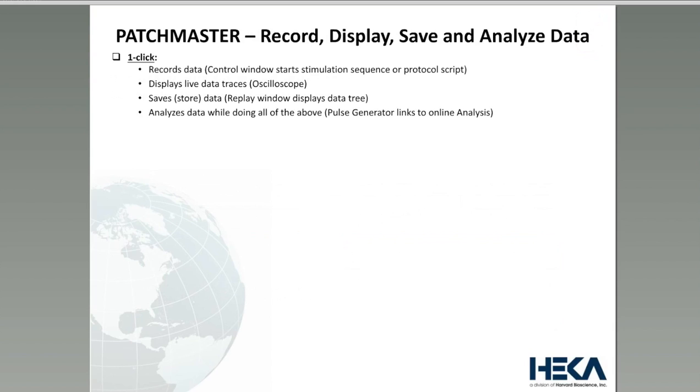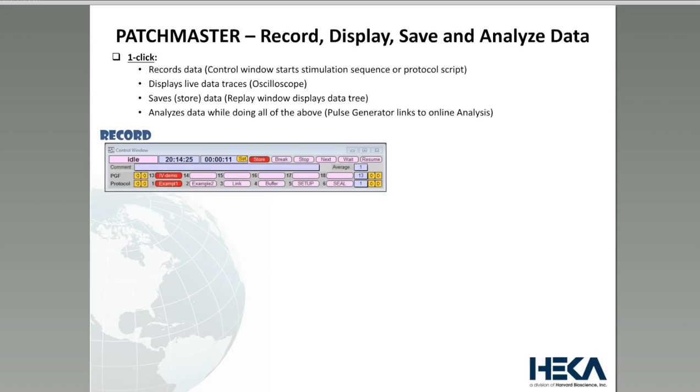Now, this brings me to the last slide of the PowerPoint presentation. I would like to quickly show you how you can now record the data, display the data, of course, save the data, as well as analyze the data. And all you need to do is press one button. Now, here's our control window. And to start the recording and display and all those other points, all you need to do, like we said before, you press the button.